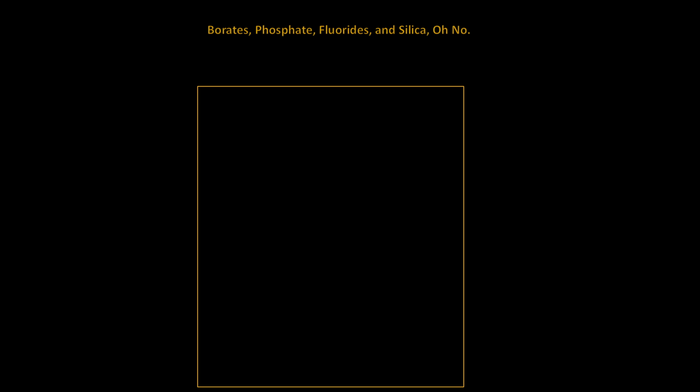At this point in time, I need to take a step backwards and talk about some of the common interferences. During the group 2 separation that was discussed in part 3, and I forgot to mention, any phosphate present in the ore sample may result in a loss of analyte.